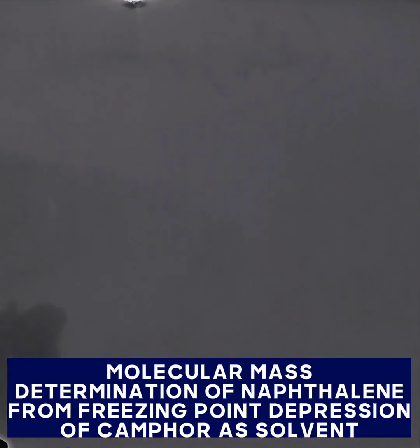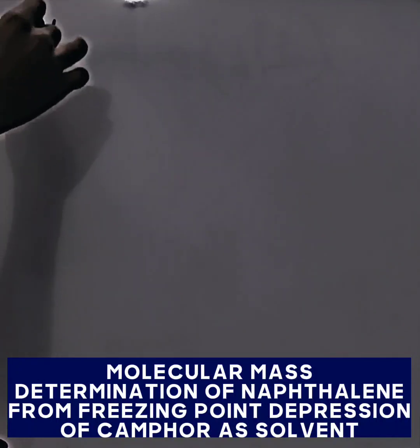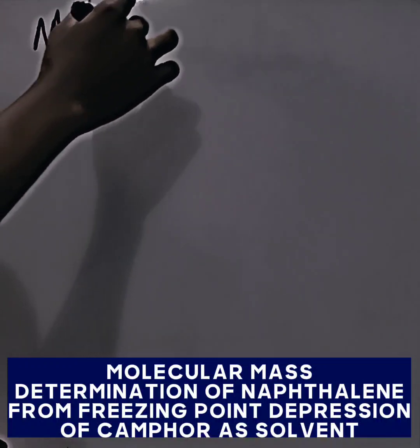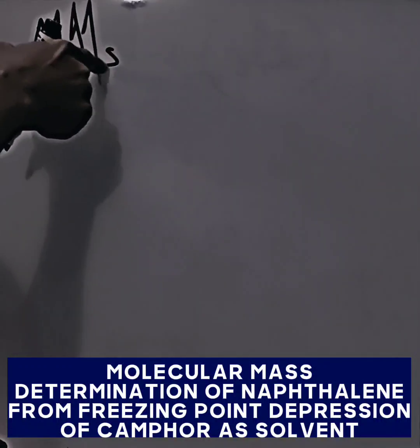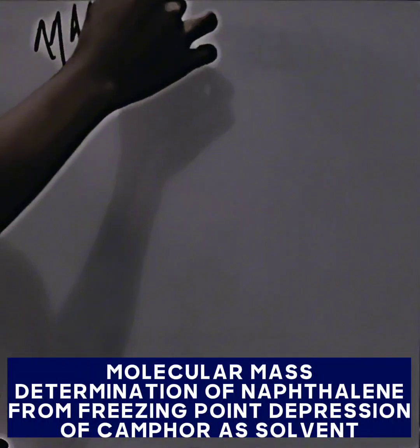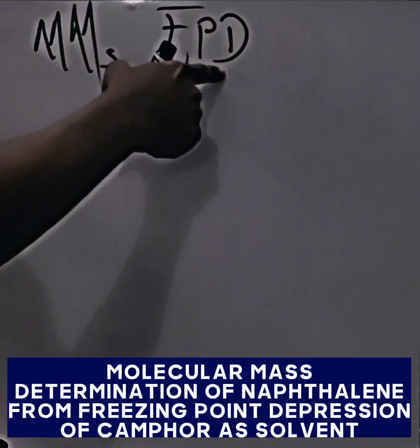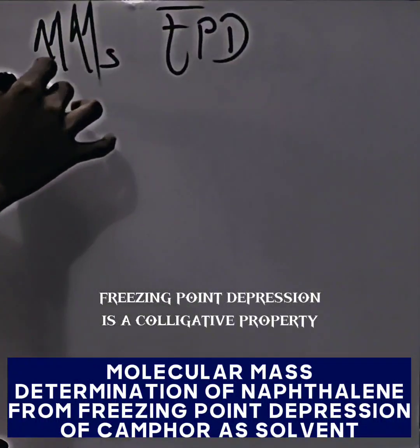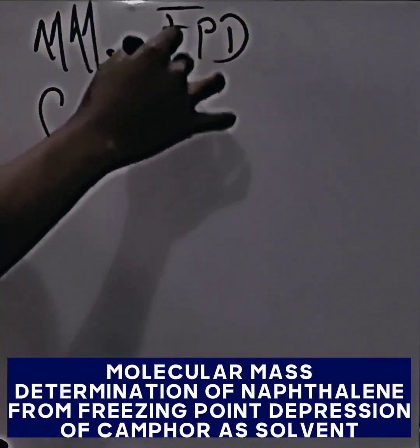So in this video, experiment 3, molecular mass determination of naphthalene. I'm symbolizing that with S because naphthalene is going to serve as our solute, from freezing point depression. Freezing point depression is a colligative property. Then we'll be employing camphor as our solvent.